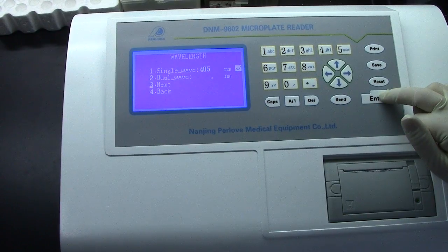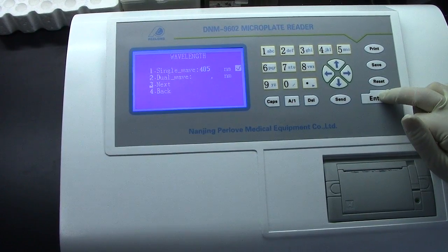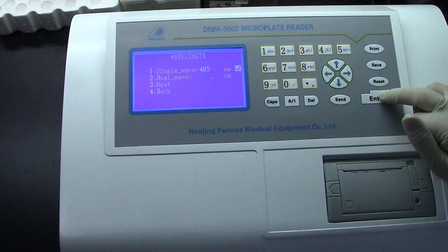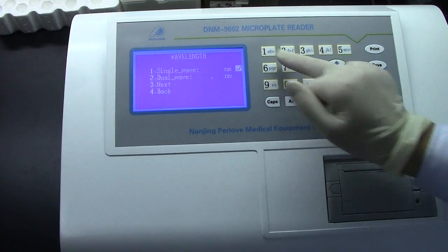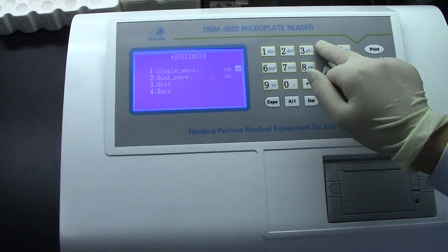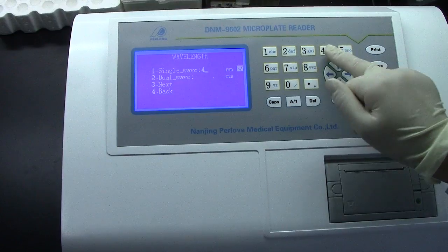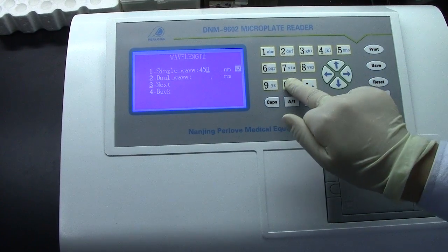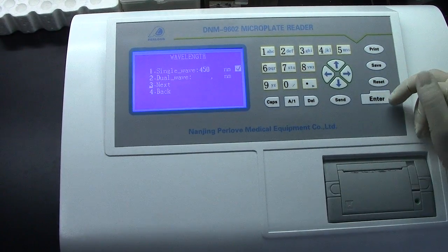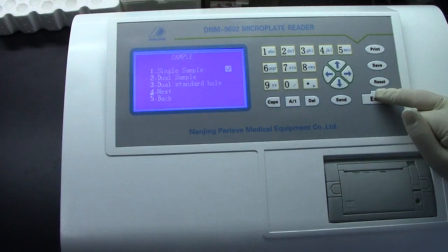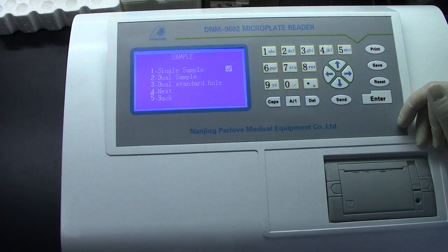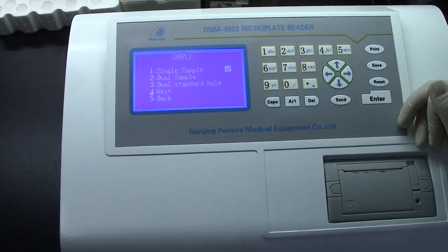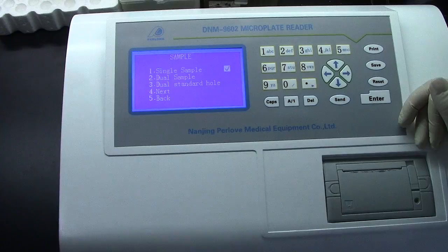The wavelength. It has single wavelength and dual wavelength. We want to choose single wavelength — 450nm wavelength. Press End to confirm. The sample: we always use single sample.